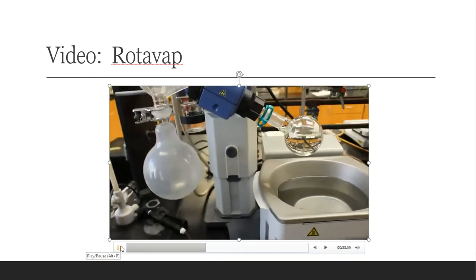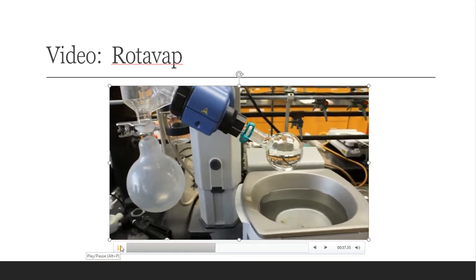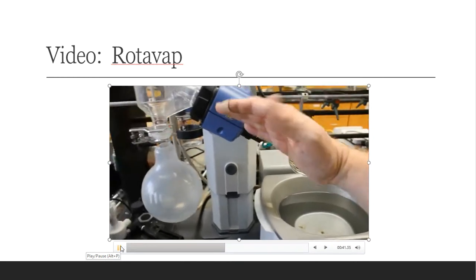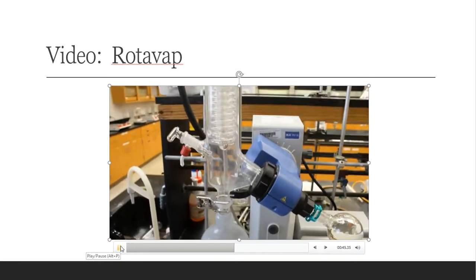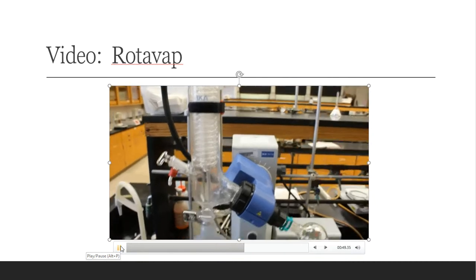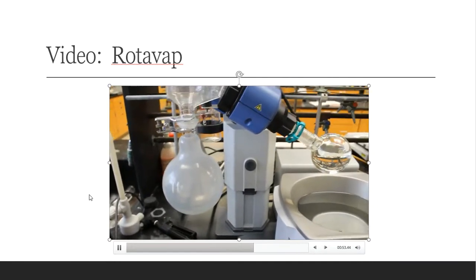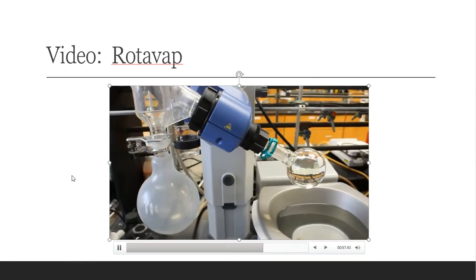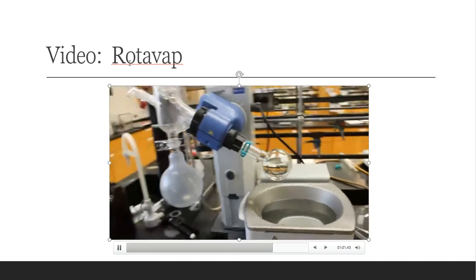What you see here in this flask is the flask with the petroleum ether and my peanut oil that's getting ready to be evaporated off. The solvent is going to go through the angled part of the rotary evaporator into a reflux condenser that you're seeing right there. And then below the reflux condenser is a collection receiving flask. So all this is a very fancy, expensive setup for a distillation. That's all that a rotovap ever is.